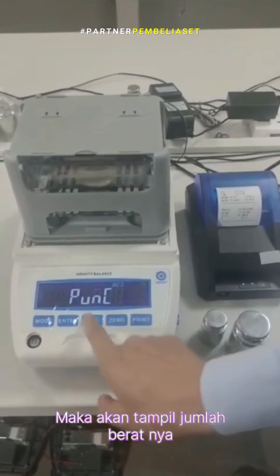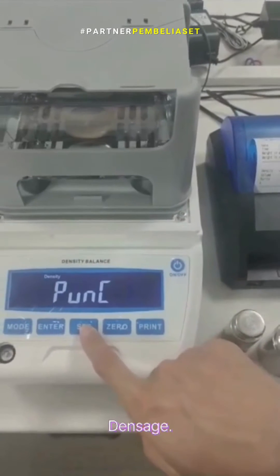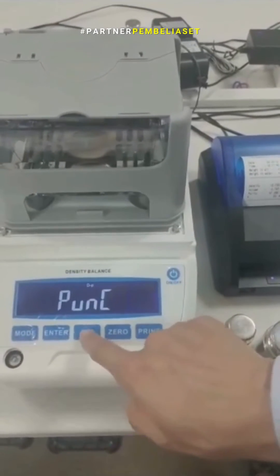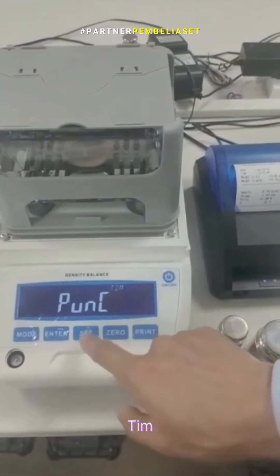this is the weight density, this is the gold density, this is the king gold density, and the other — this is the data setting, time setting.